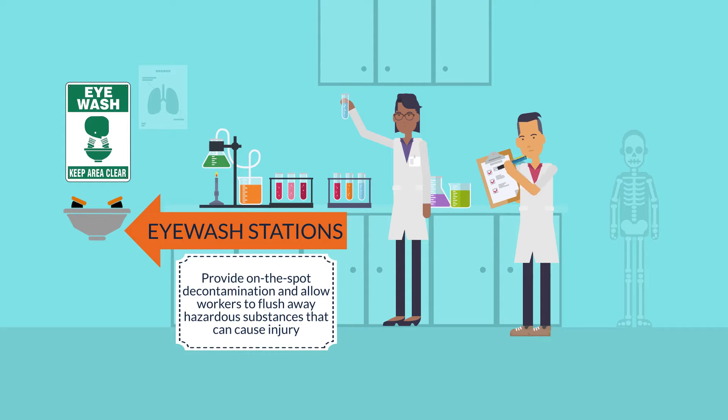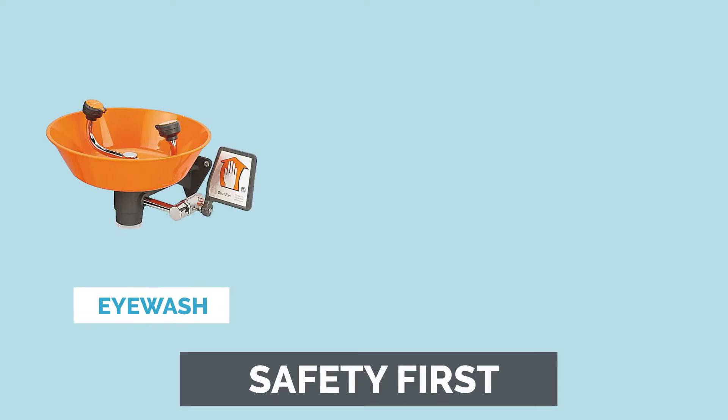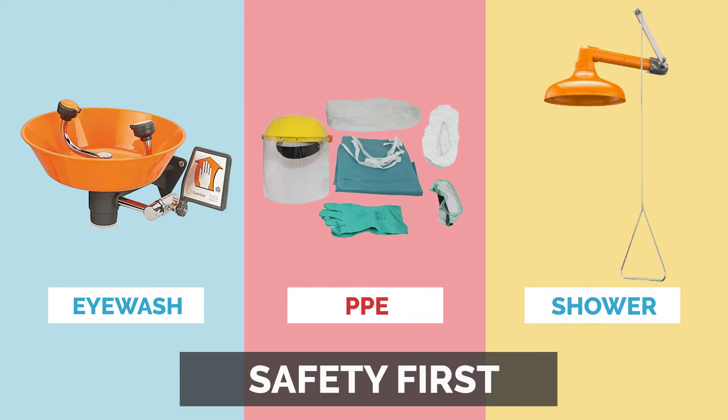Eyewash stations provide on-the-spot decontamination. They allow users to flush away hazardous substances that can cause injury. Accidental chemical exposures can still occur, even with good engineering controls and safety precautions. Emergency showers and eyewash stations are a necessary backup to minimize the effects of accidental exposure to chemicals.